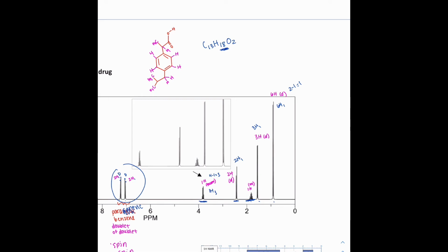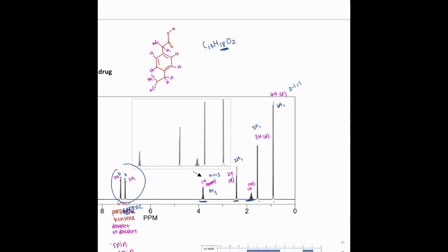And while this does show up a little closer to 4 than where we would want to see this for the carbonyl compounds, I think it's still really close, because looking at the structure, you don't have an ether, an ester, and we don't really have alcohols there either, because it's just from that carboxylic acid.